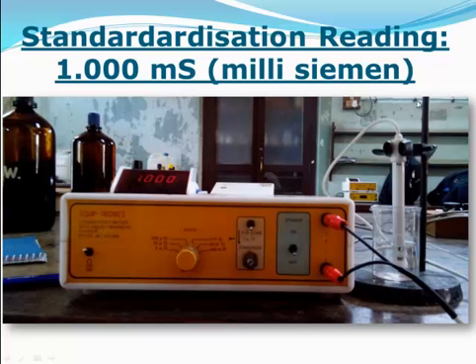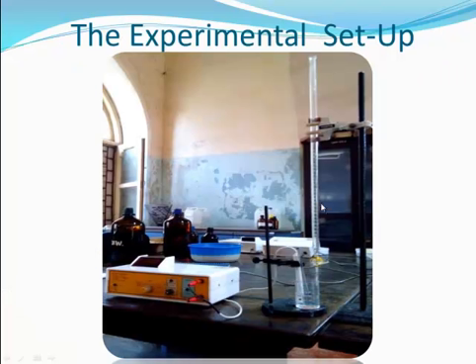Also, since we are carrying out a titration, we'll need a burette which will be filled up with the base, as the analyte here is an acid. Now we are ready to take the reading. So what can be done is, we can add from the burette about 1 ml of the solution, stir this solution and take down the reading on the display.